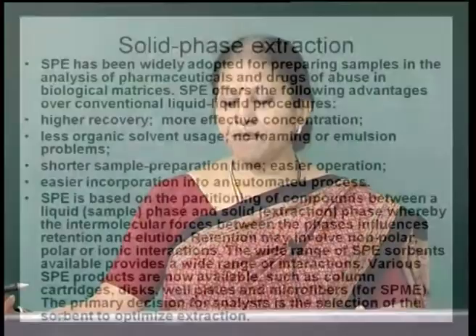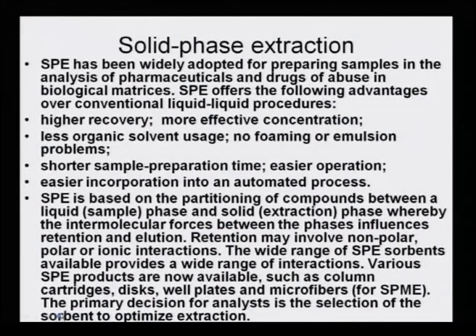SPE is based on the partitioning of compounds between a liquid sample phase and a solid extraction phase, whereby the molecular forces between the phases influence retention and elution. Retention may involve non-polar, polar or ionic interactions.